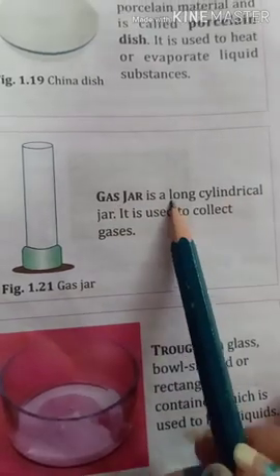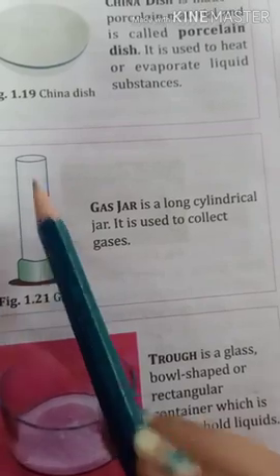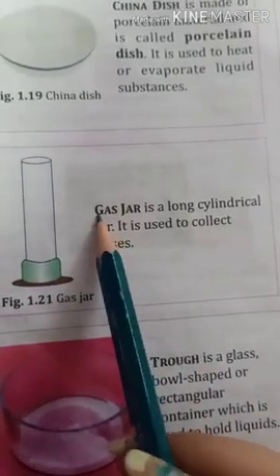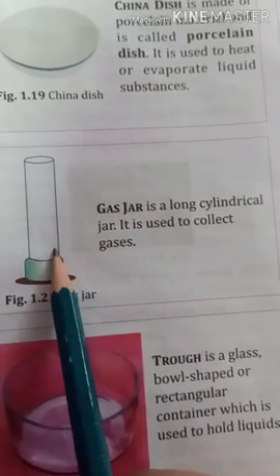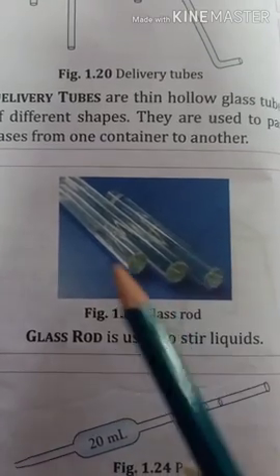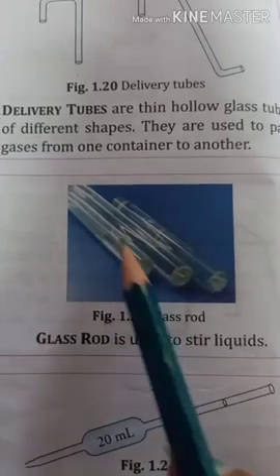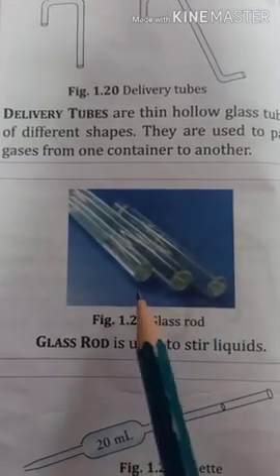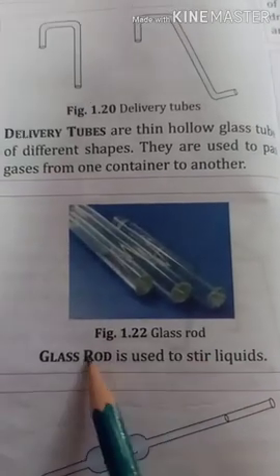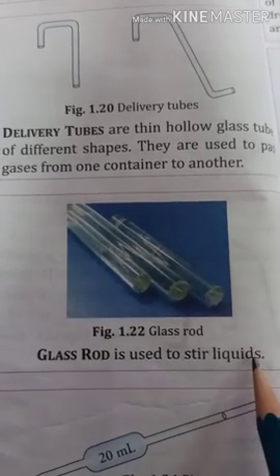Here we have gas jar. This gas jar is a long cylindrical jar, a jar of cylindrical shape, and is used to collect gases. So this gas jar is used to collect different gases. This is glass rod, made up of glass. These rods are used to stir liquids, or we can say glass rods are used to mix solid substances in liquid.